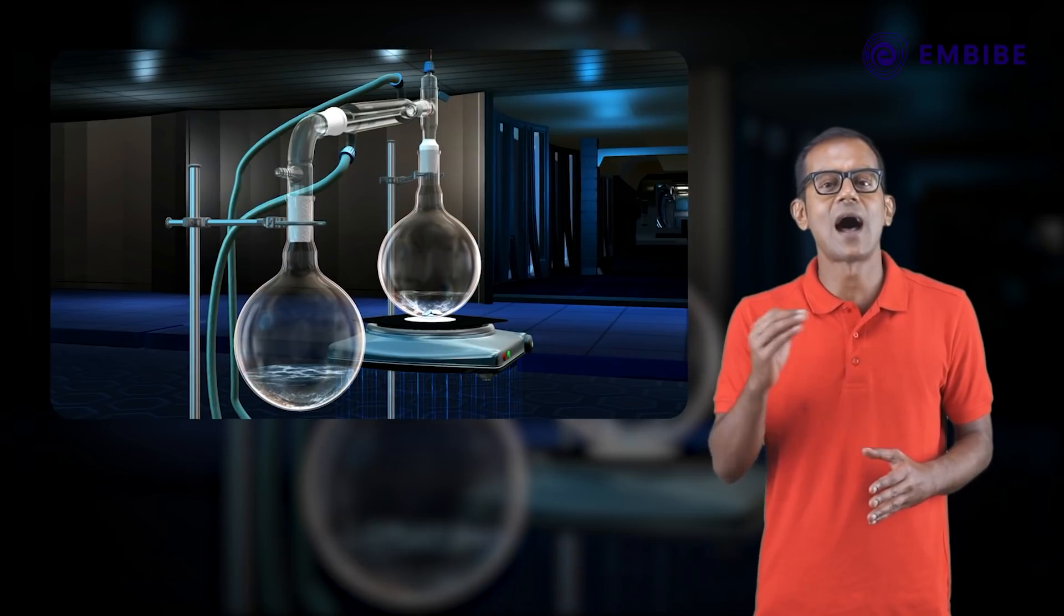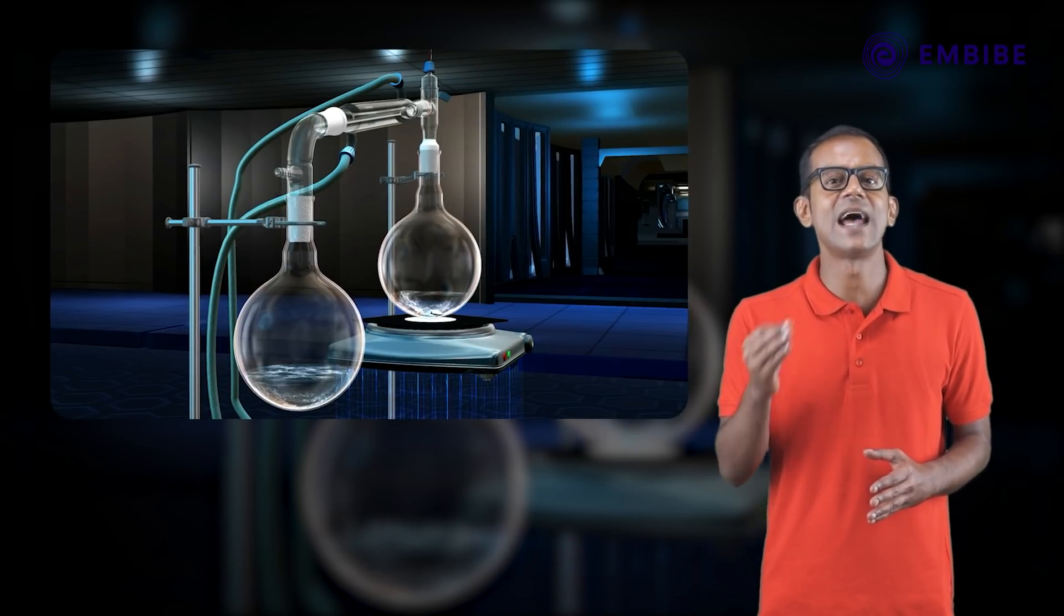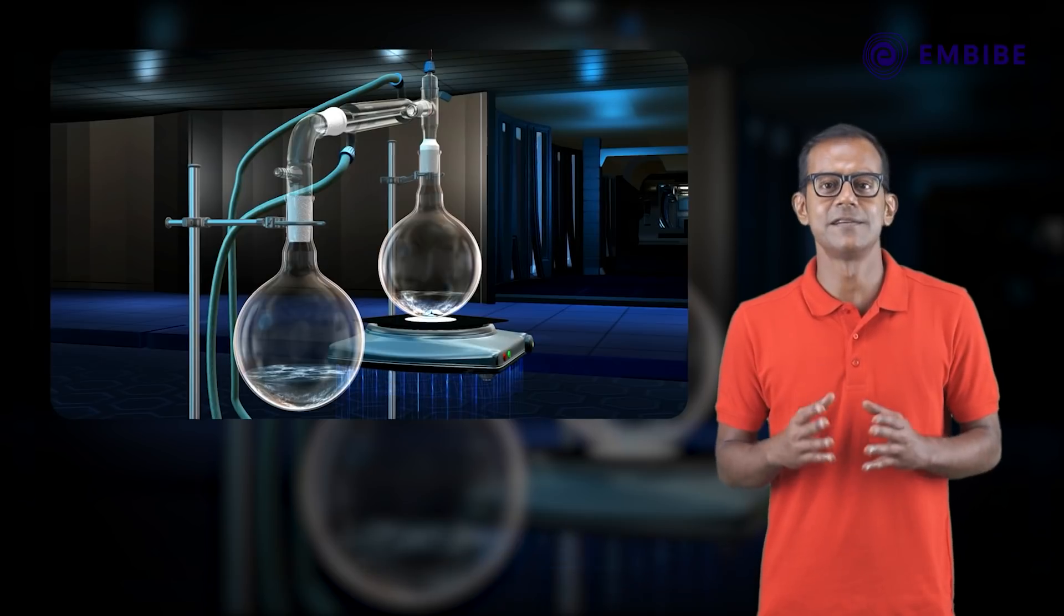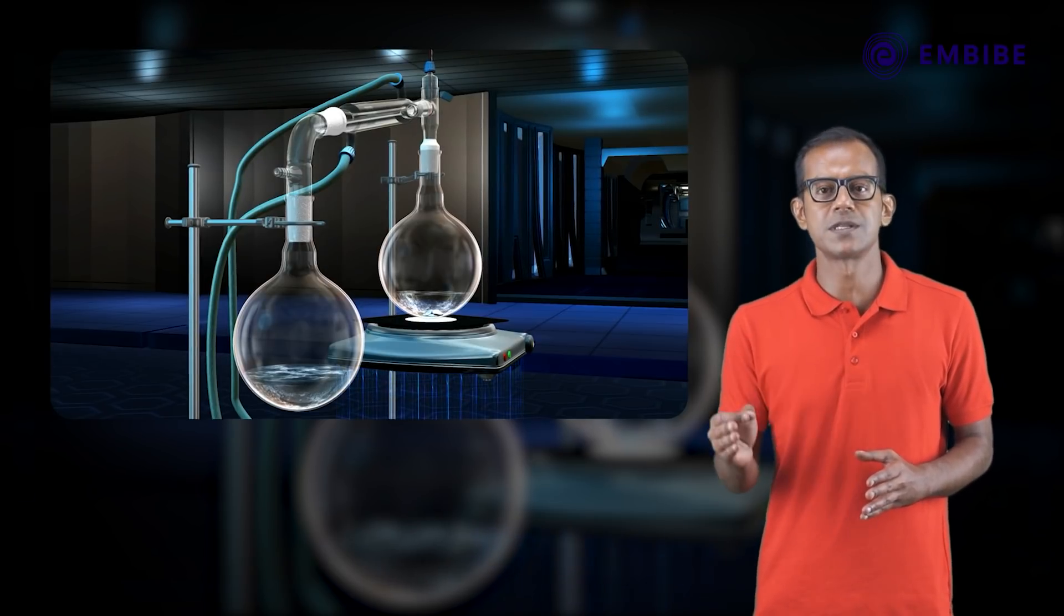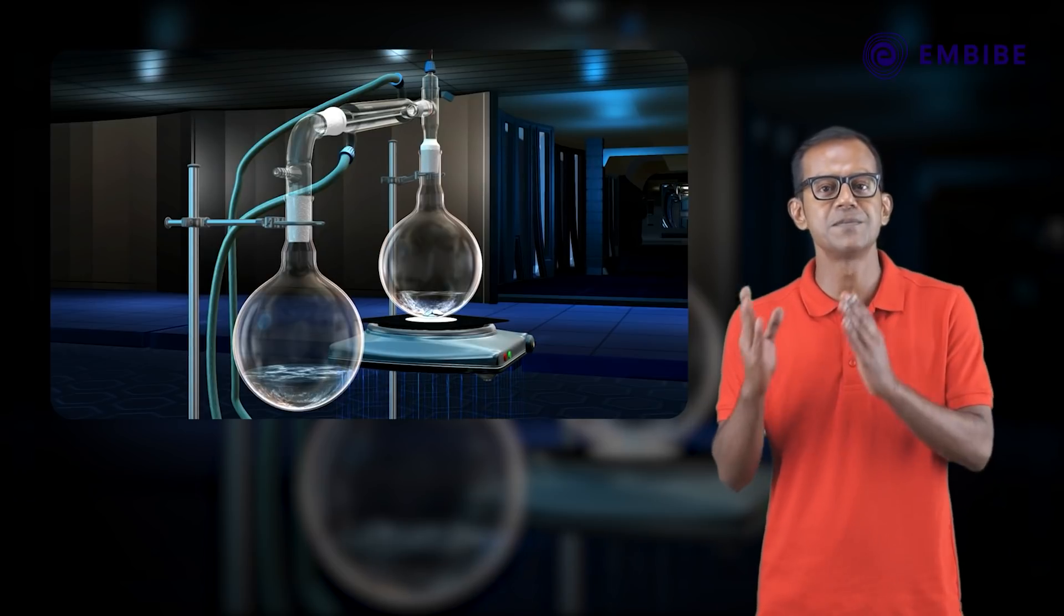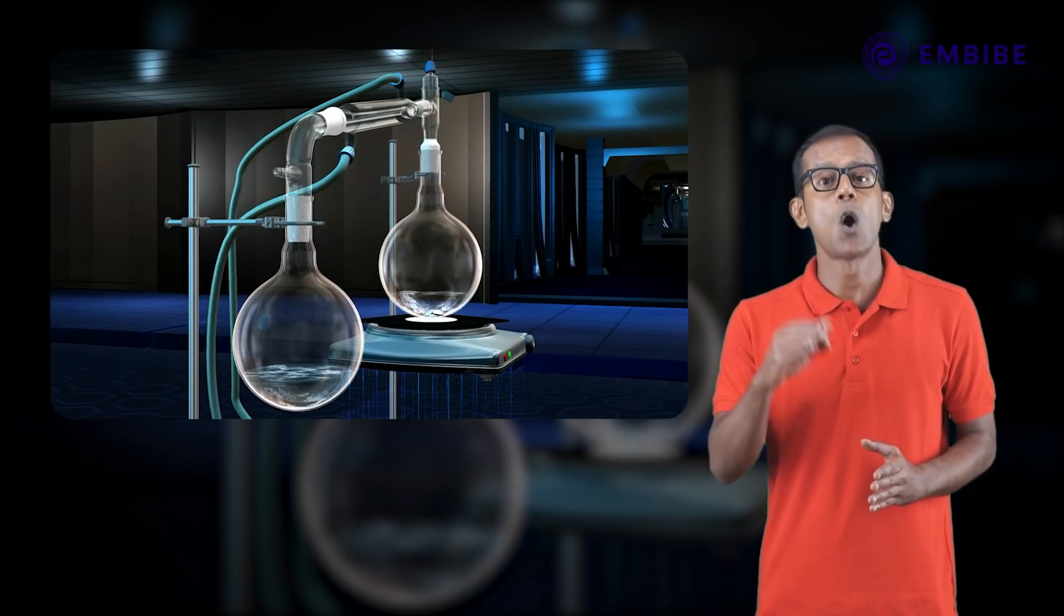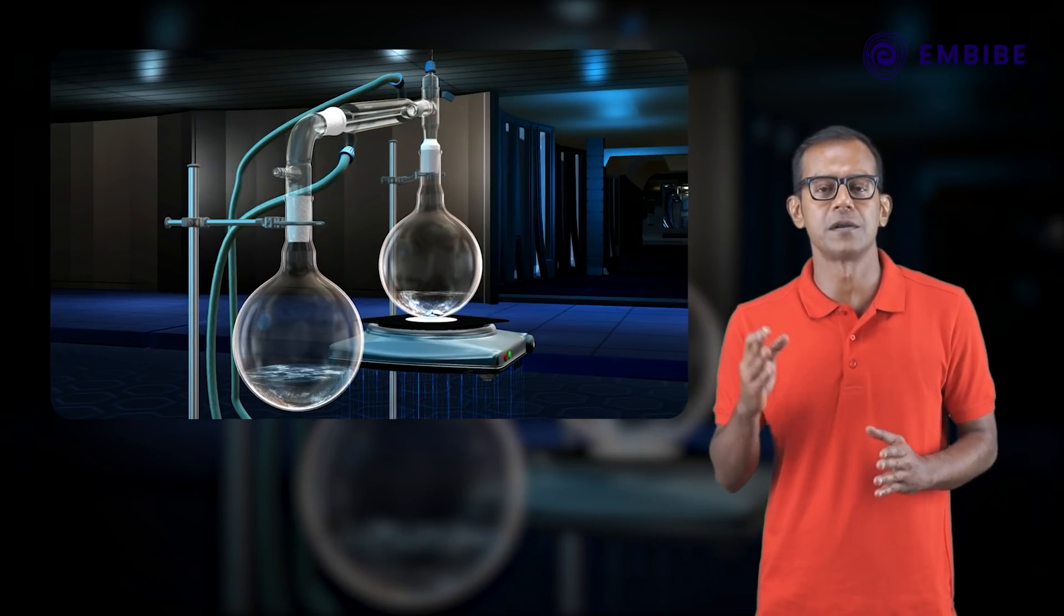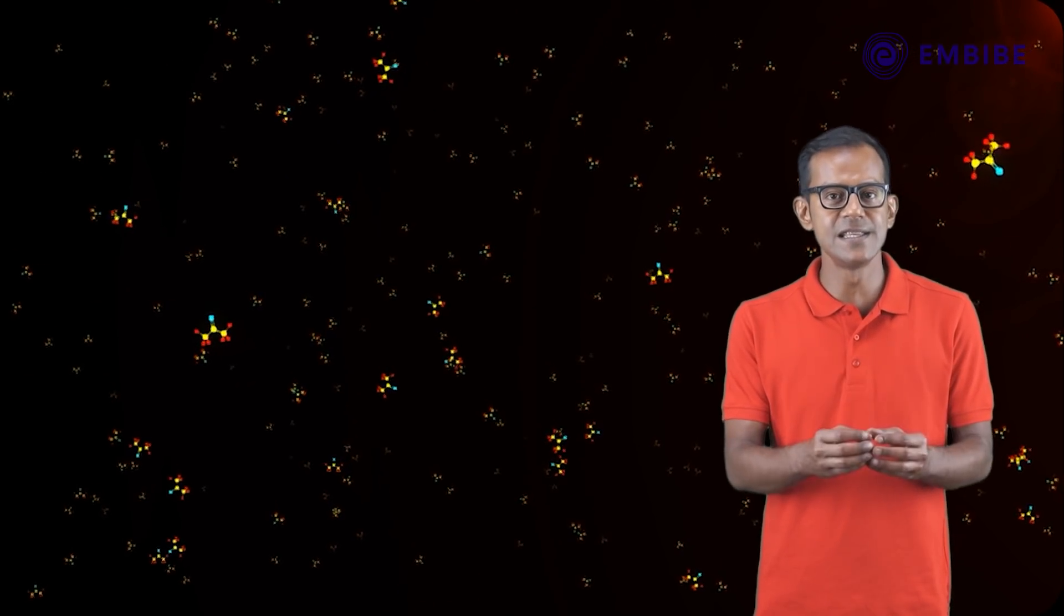When almost all of the acetone has been collected in the receiver, switch off the heater. The liquid which remains in the boiling flask is actually the water, which has a higher boiling point than acetone. In general, simple distillation is the process of separating the components of any homogeneous mixture. The component with the lower boiling point vaporizes and gets condensed, while the one with the higher boiling point is left behind.